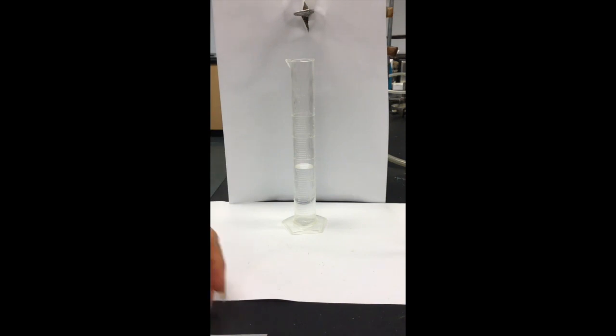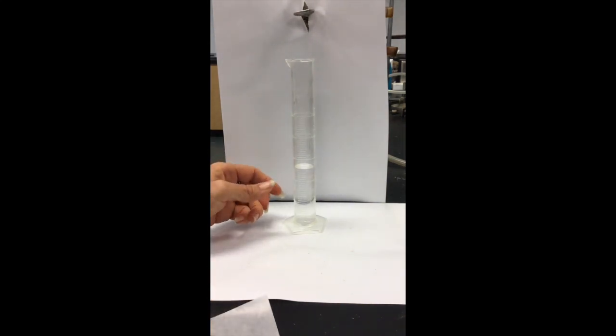Next I want to get the volume of my rocks that I measured the mass of. In order to do that, I'm going to take a 50 ml graduated cylinder and add deionized water to about 25 ml.